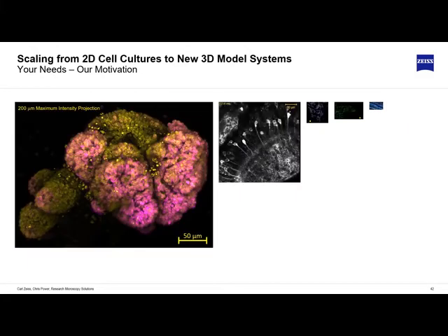If I present them in the actual scales relative to each other, you see that sometimes some of the high dynamic images, some of the very fast images, are very small relative to other things. So if we can improve the speed, if we can improve the sensitivity, we don't just capture what we want to see, but we can capture a bigger area of that.